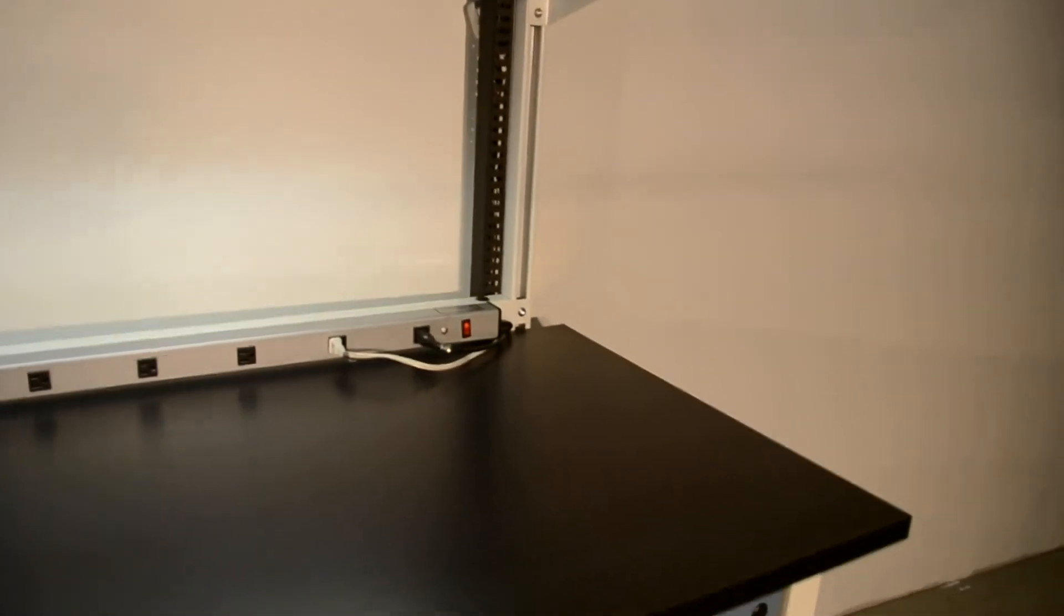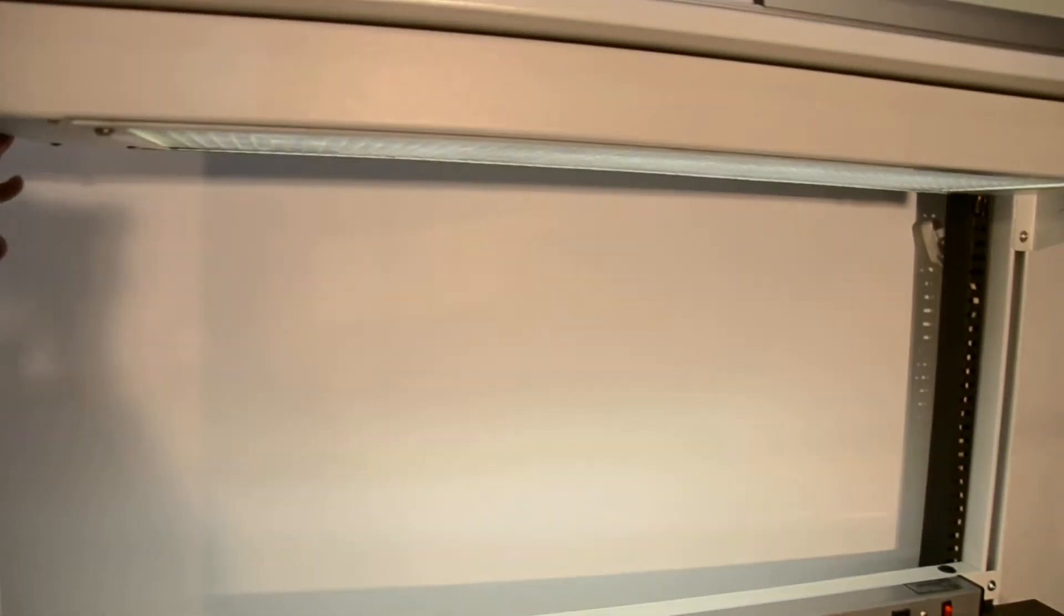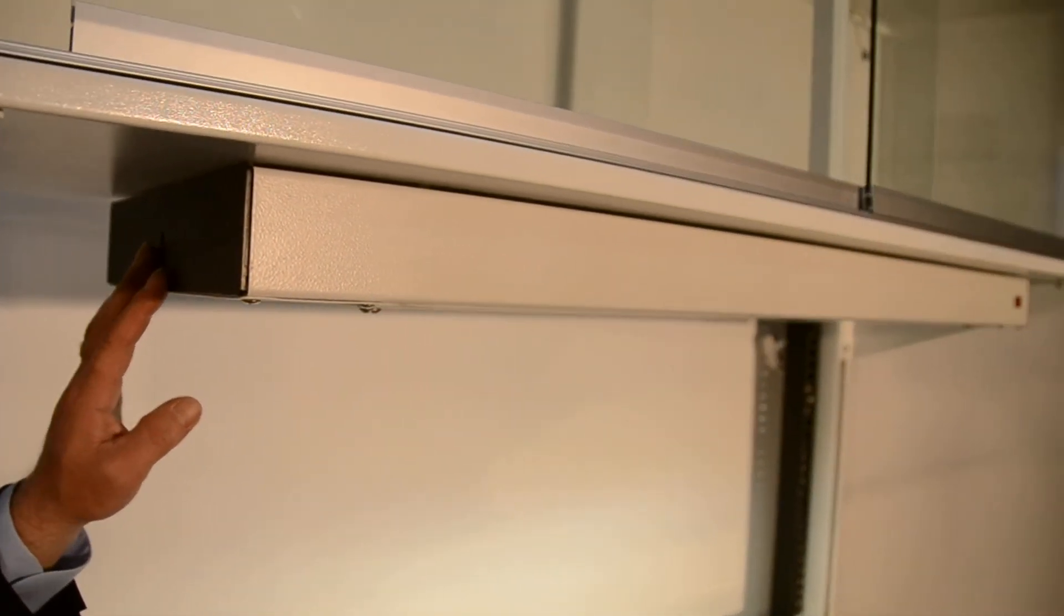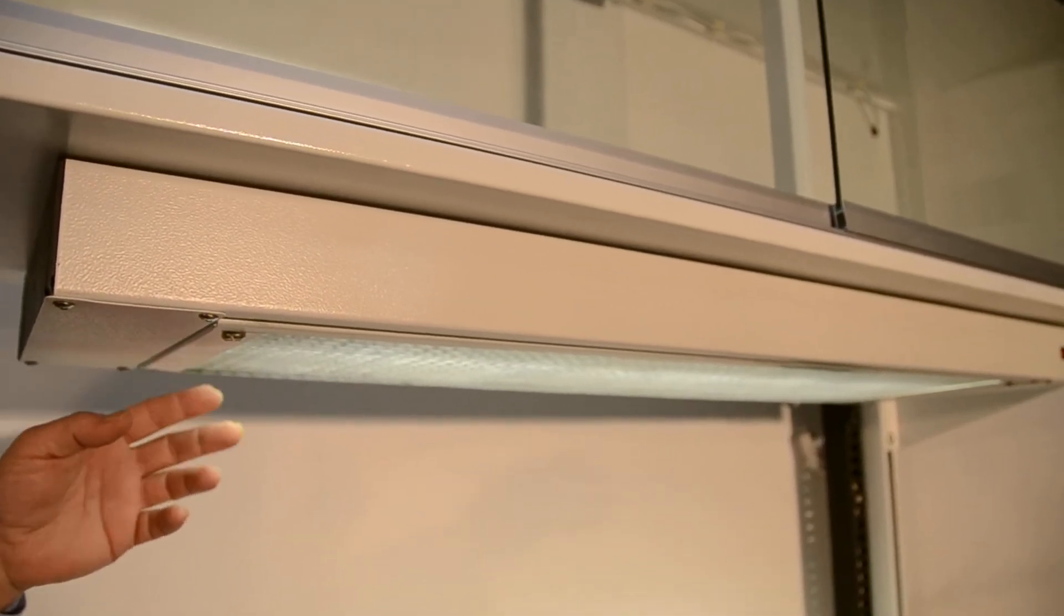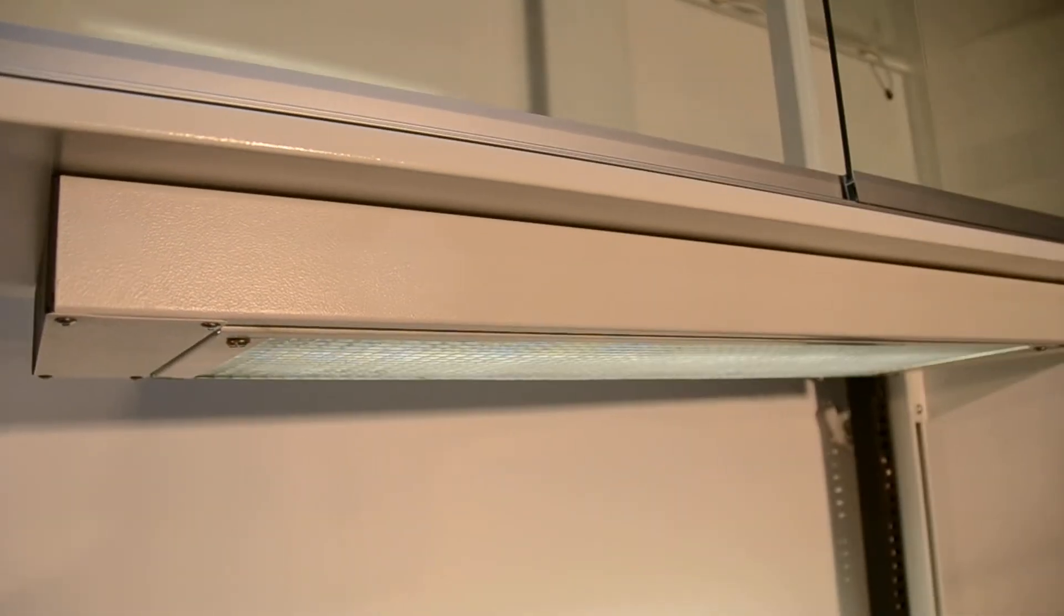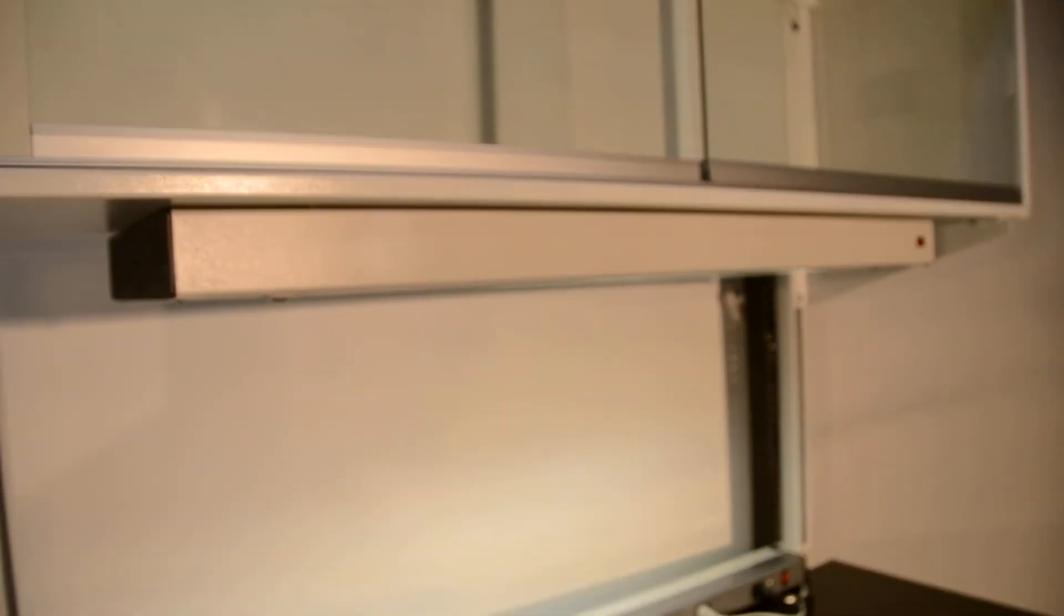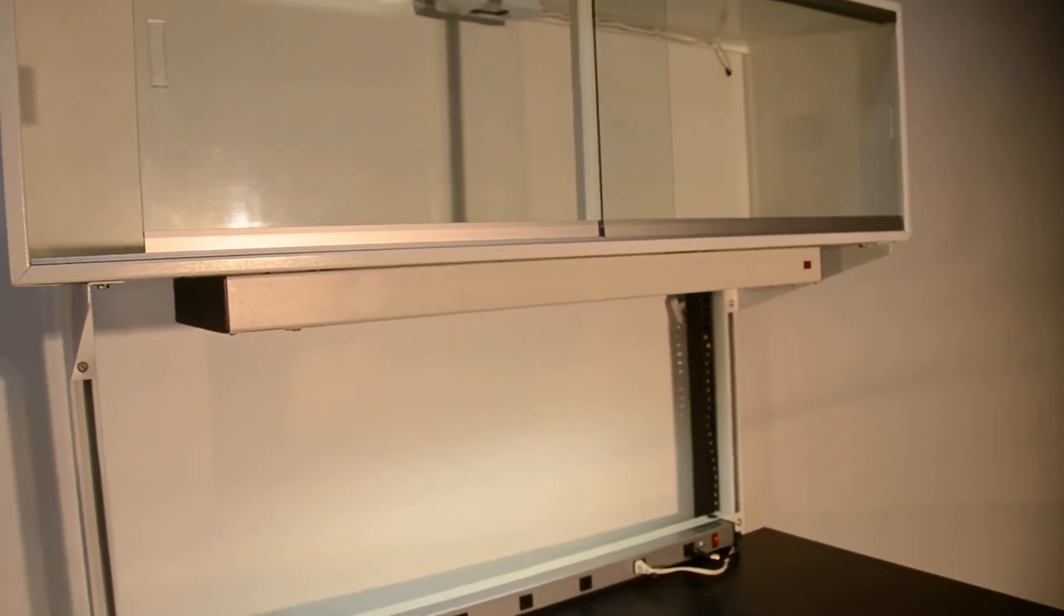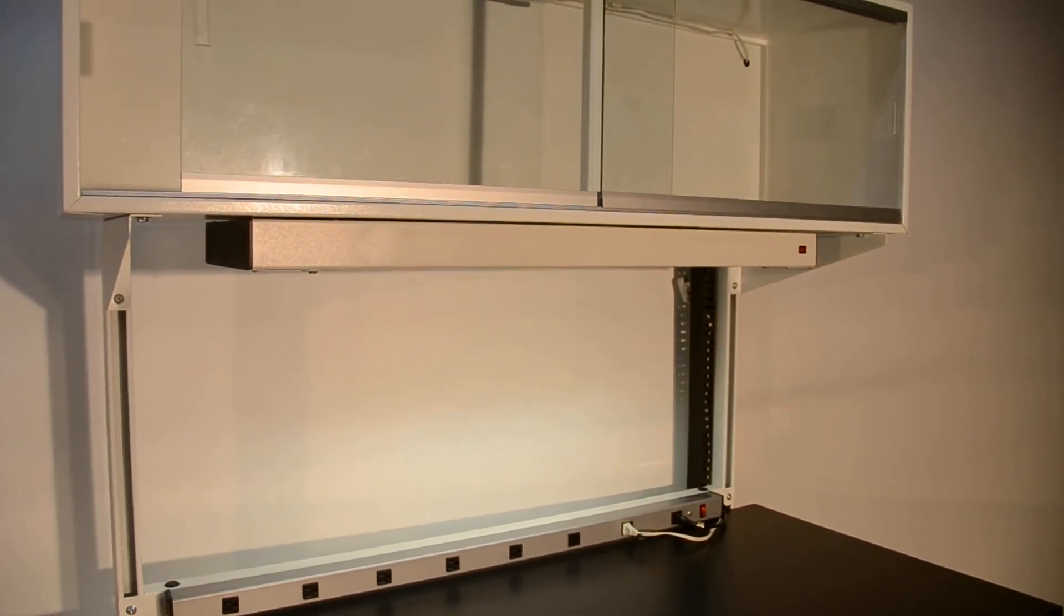We have a task light that is mounted underneath the cabinet. This is also shown with our optional parabolic lens. Parabolic lens basically directs the light more downward instead of diffusing it outward. It also helps to brighten it up a little bit. That is standard on any of our deluxe series light fixture. You can add that as an option.